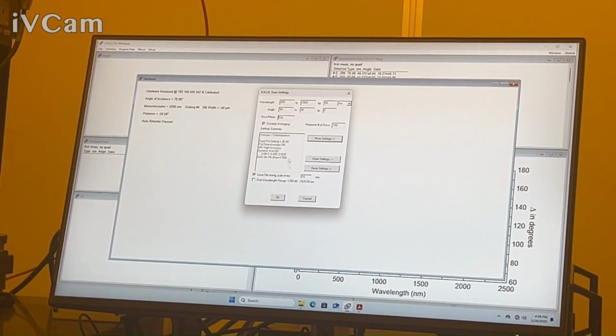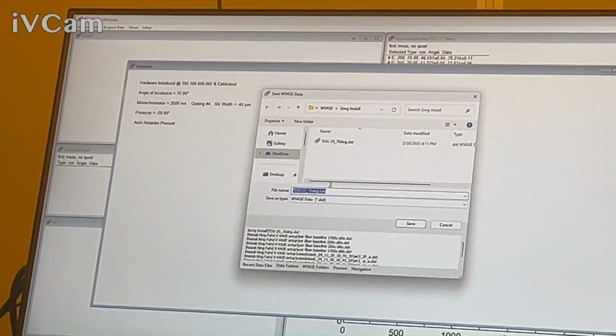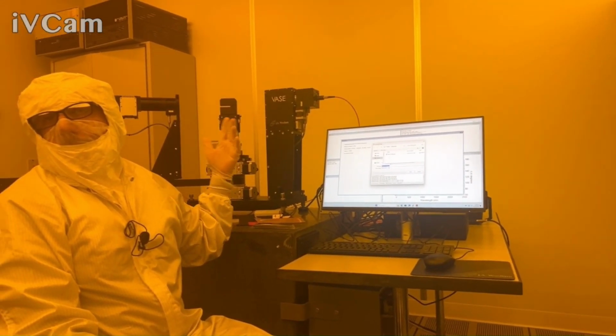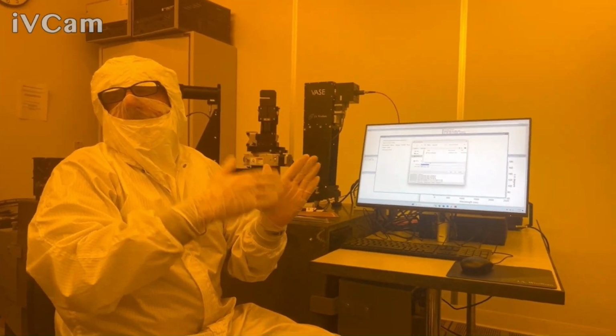Okay. So you recommend us doing the air? No, no, you don't. I recommend calibrating off this wafer, probably daily or at least every few days. I mean, again, you'll get used to it. It depends on how tight of stuff you're looking for.